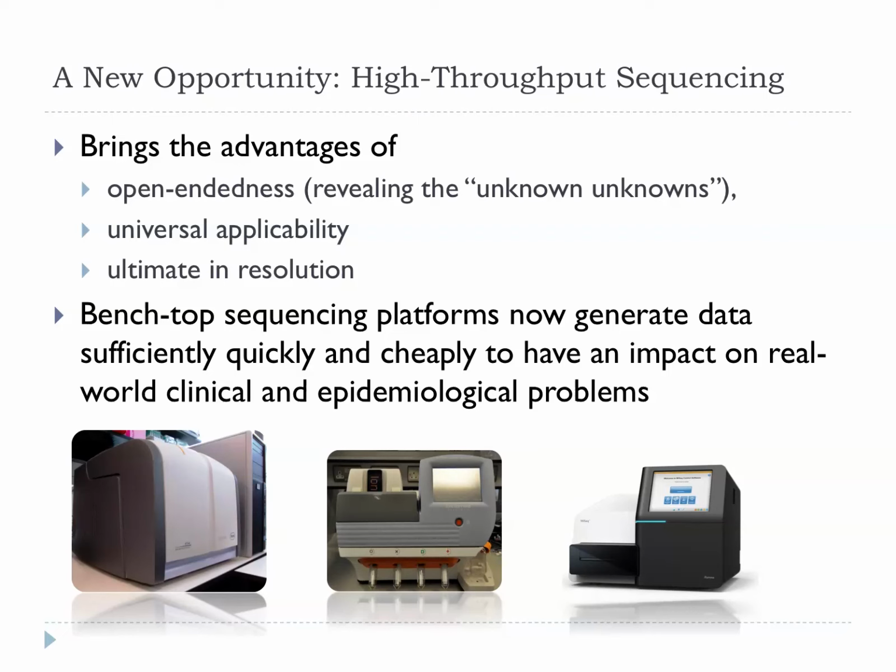One of the latest developments here is these benchtop sequencing platforms, which are about the size of a laser printer, sit neatly on the bench and actually bring this kind of sequencing into the realm of the average laboratory, not confined to sequencing centres anymore. And this high-throughput sequencing brings all sorts of advantages.